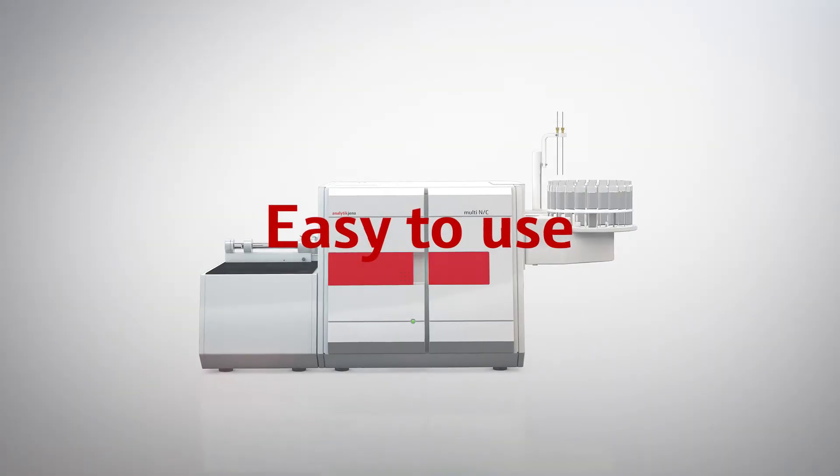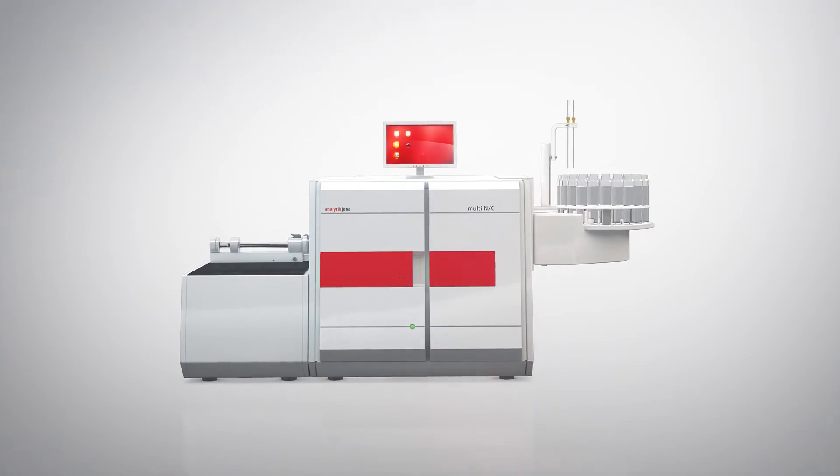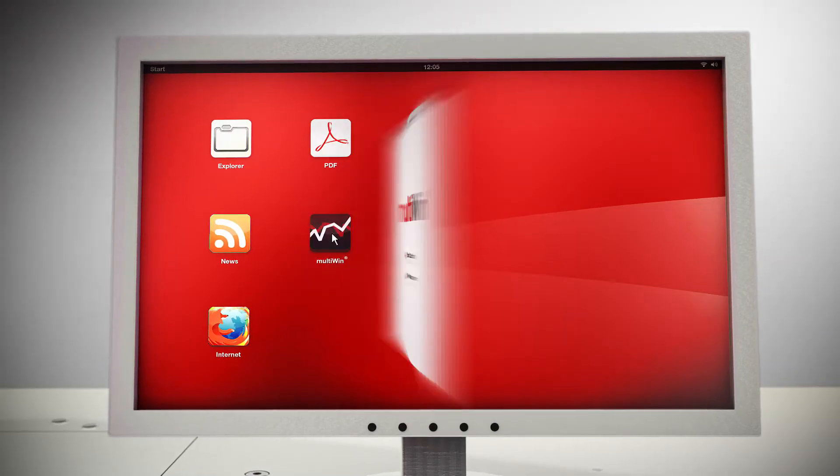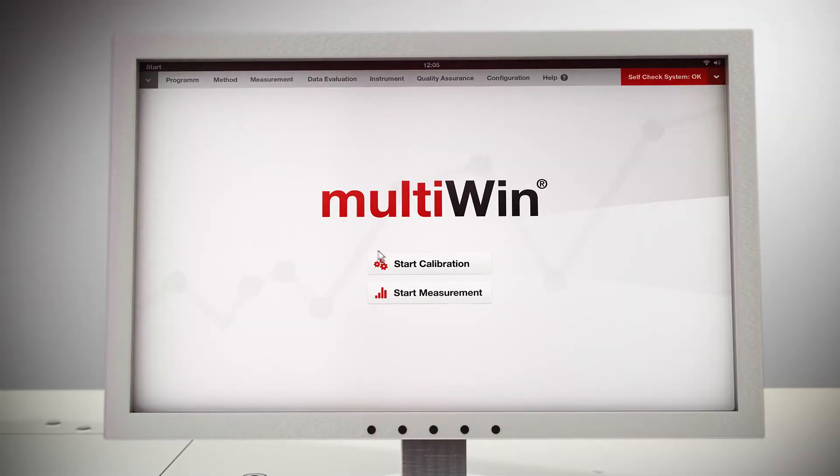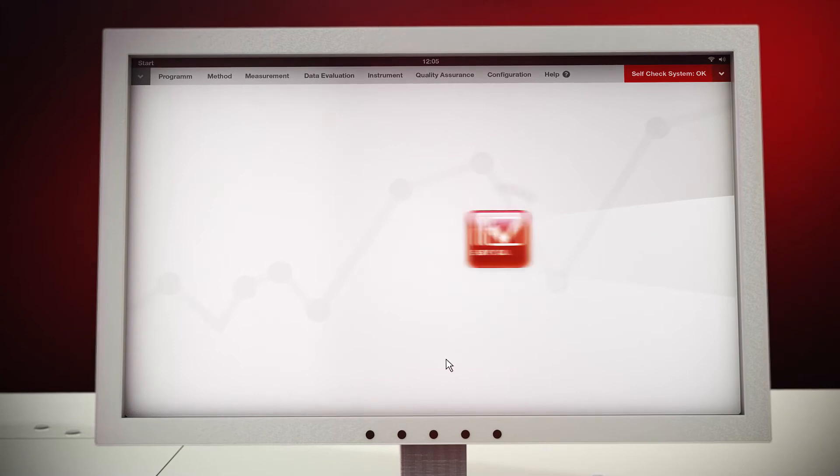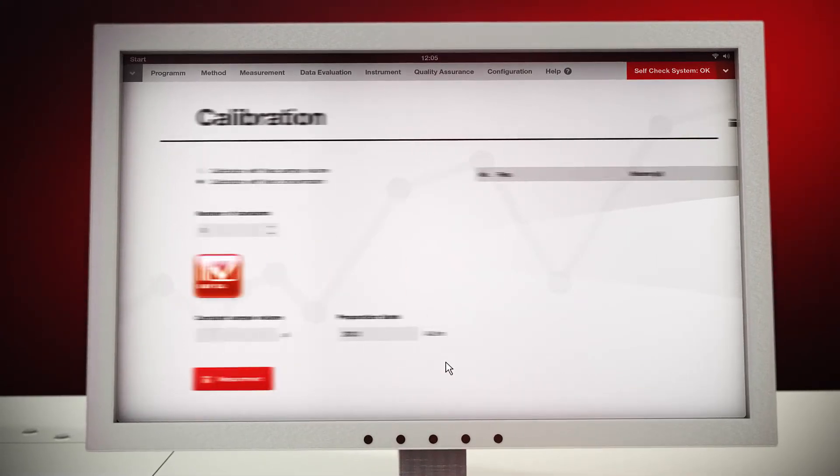Using a high-performance analyzer has never been so easy. Our Multi-Win software package provides user-friendly, intuitive operation.